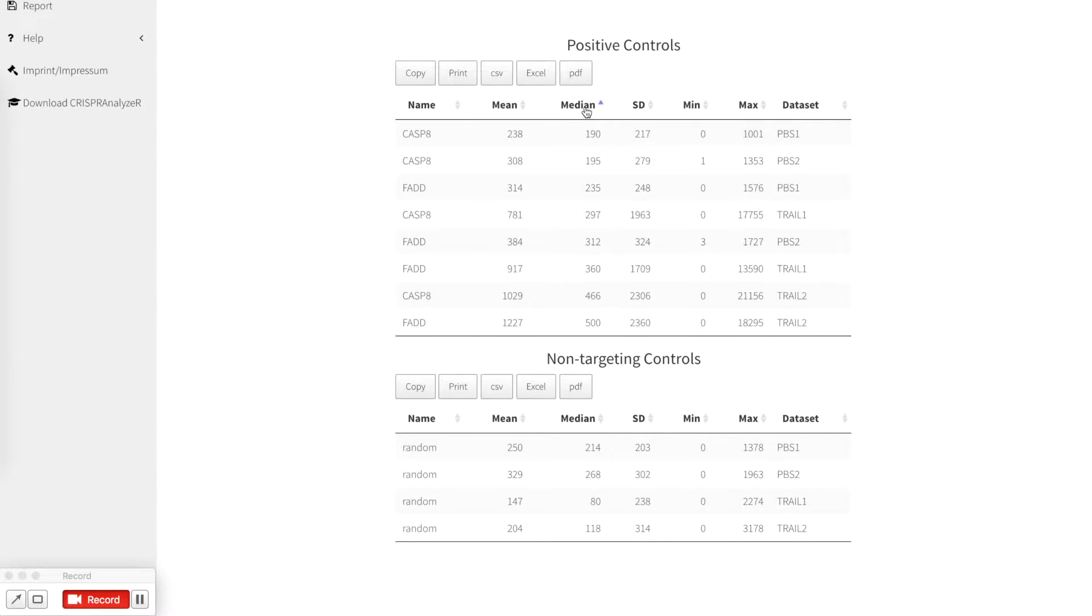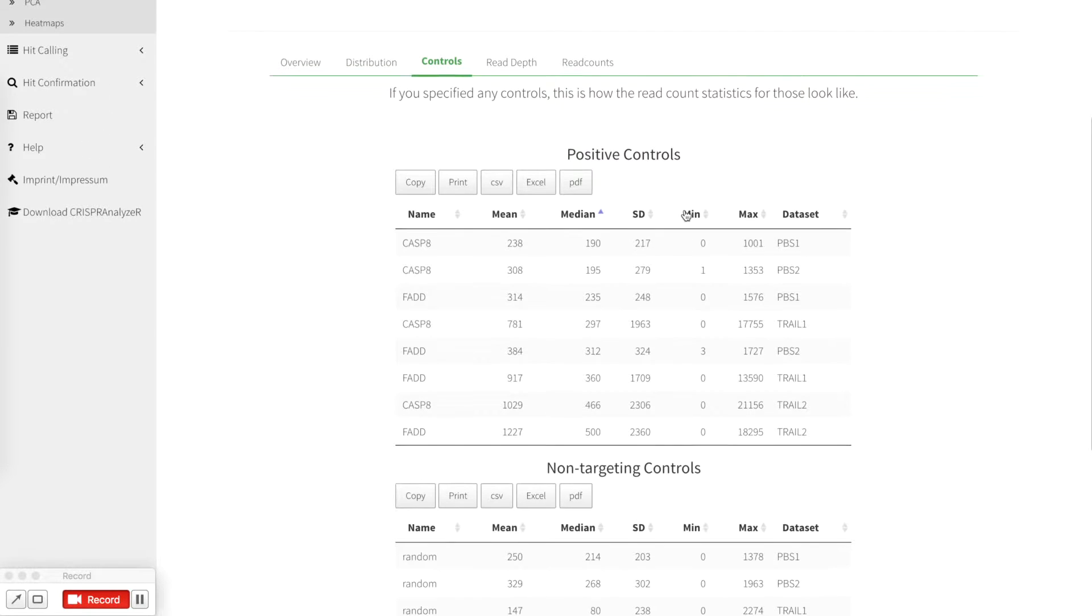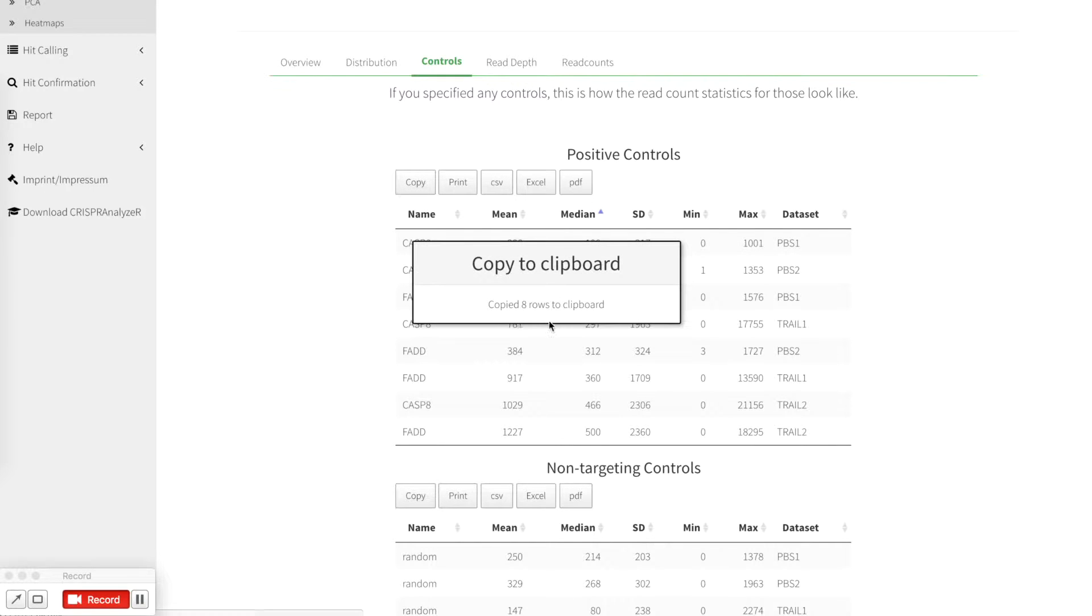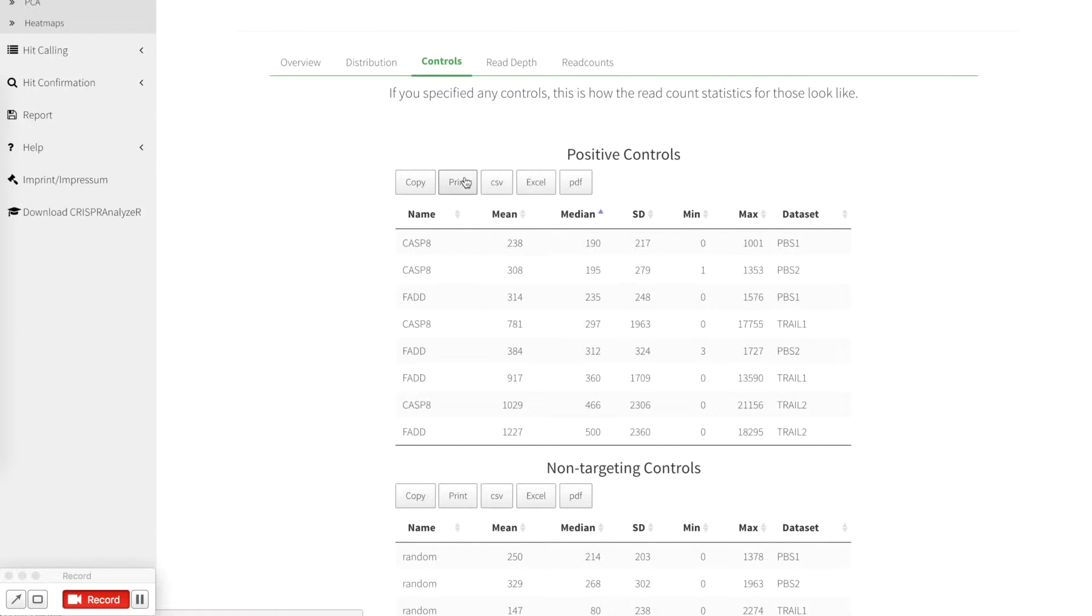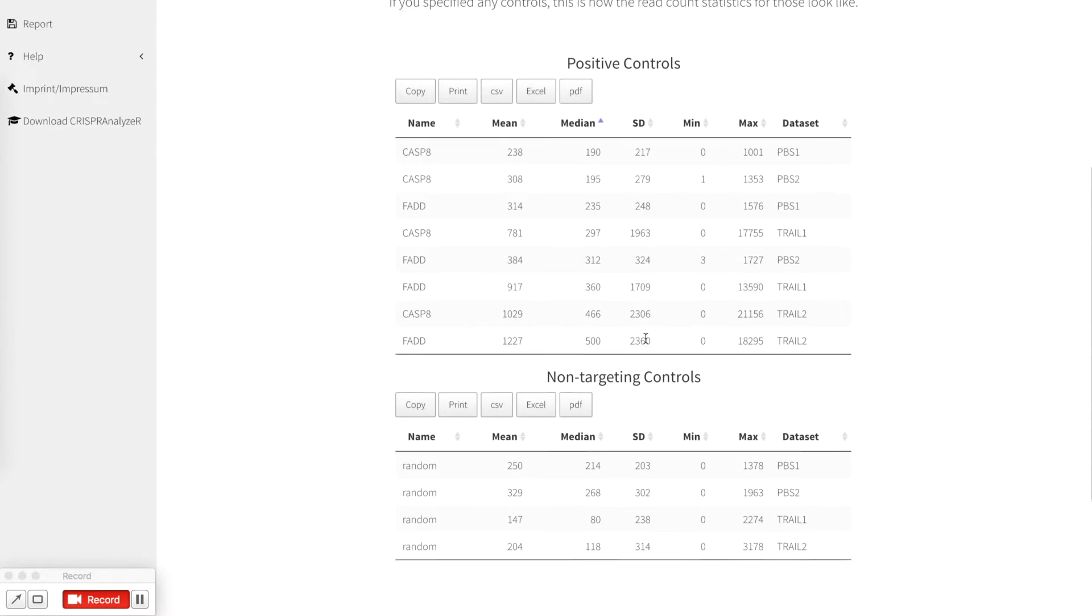You can always click in every table and sort it according to your needs. If you like to download this table you can directly copy it to your clipboard, print it, download it as a comma separated file, formatted excel file or as a pdf. This is for all the tables.